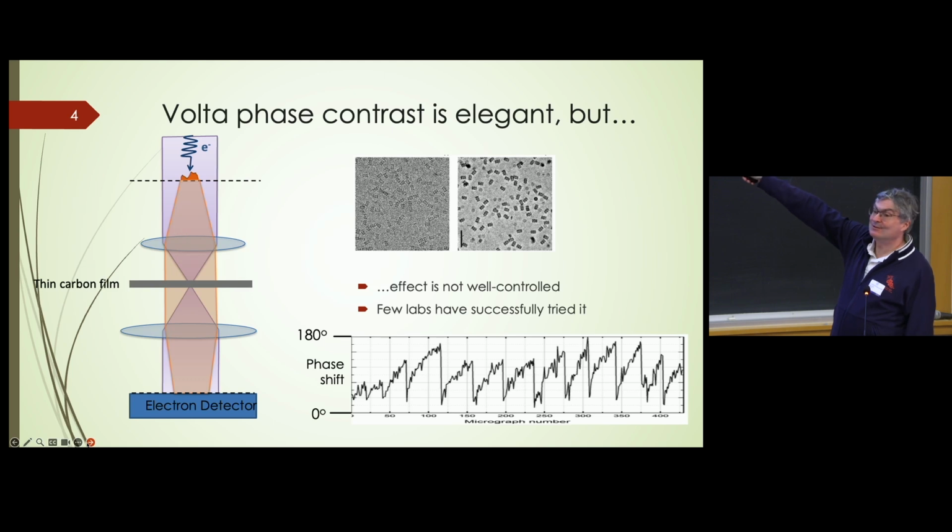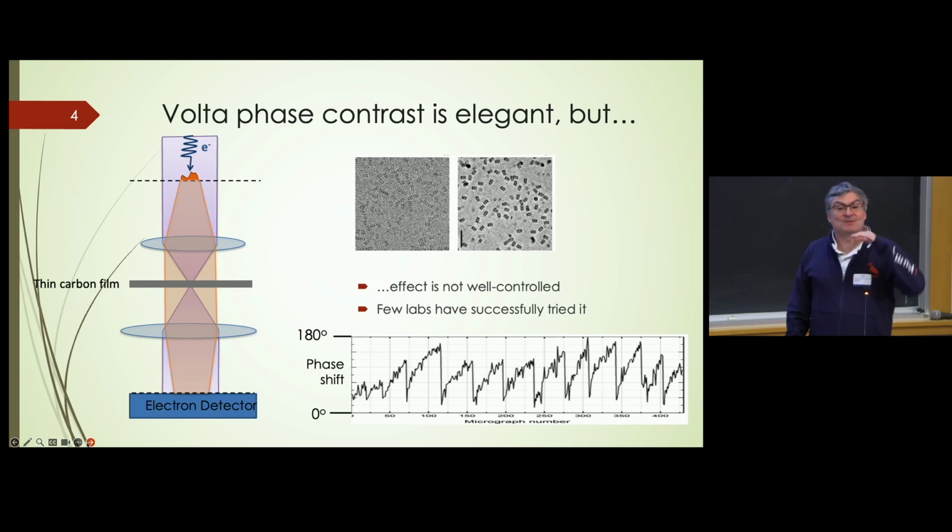Then you need to find a new spot on the phase plate and the process starts again. And each time you move the phase plate, you slightly change the properties of the microscope. And notice that the phase shift varies very strongly over the time needed to take your data. So you don't have a microscope with constant properties as you want to later put the data back together and get biological results from it.